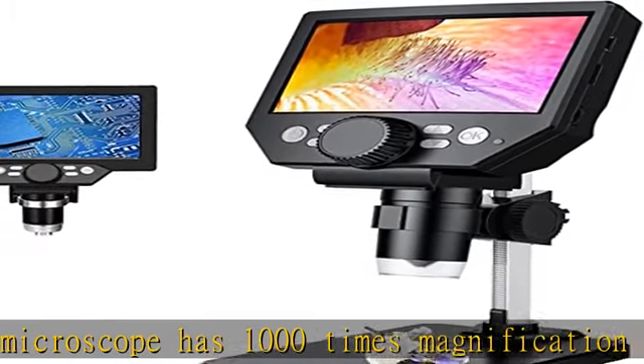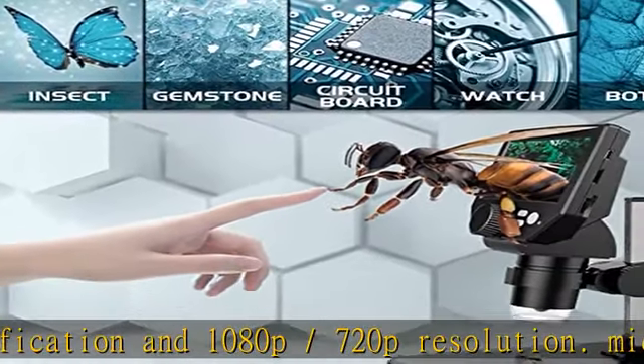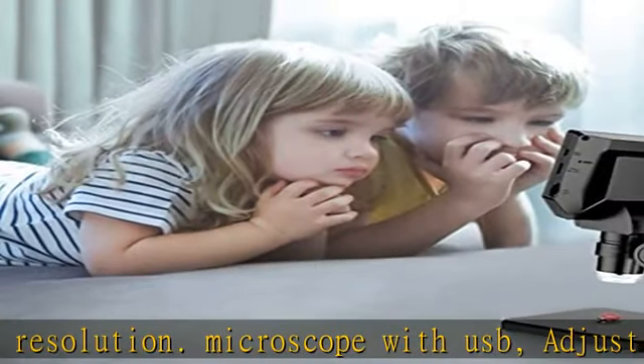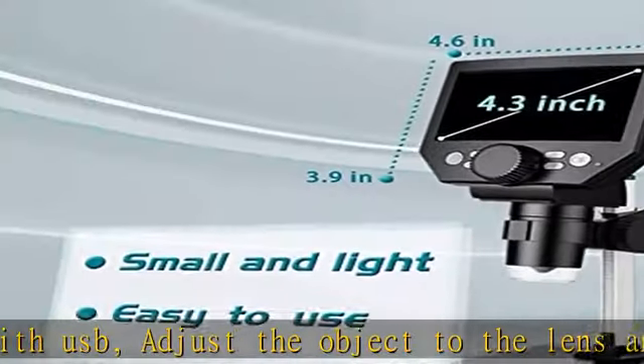It is very convenient. It has a built-in rechargeable lithium battery which can work for four to five hours. It is portable and independent, with enough power for outdoor observation and can be used by hand without the bracket.